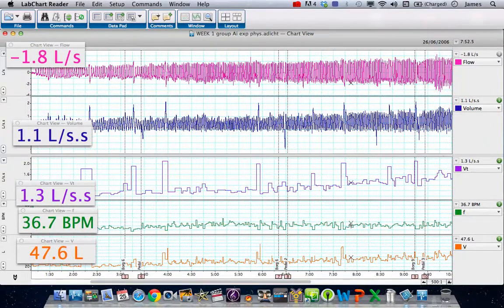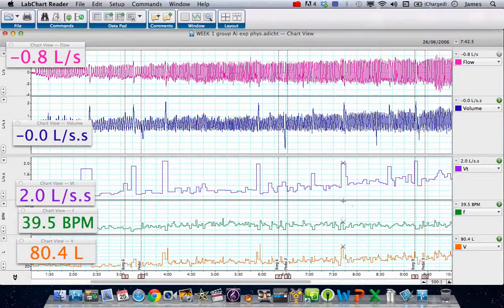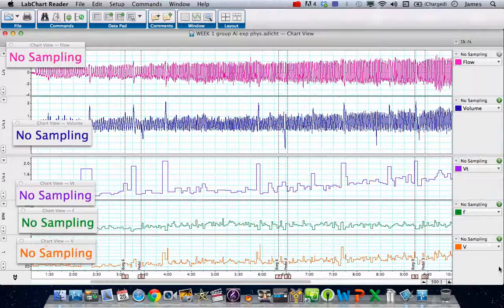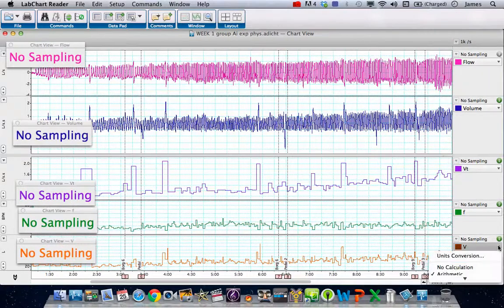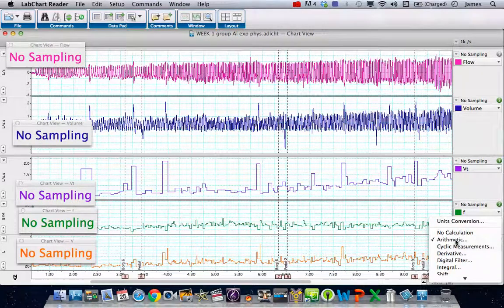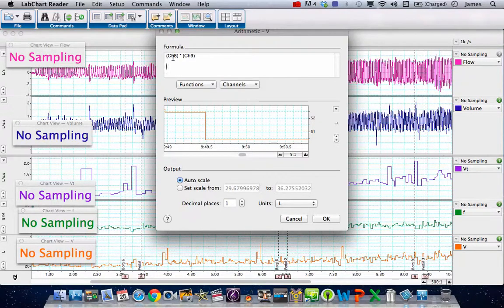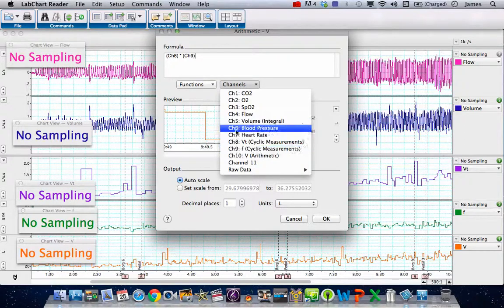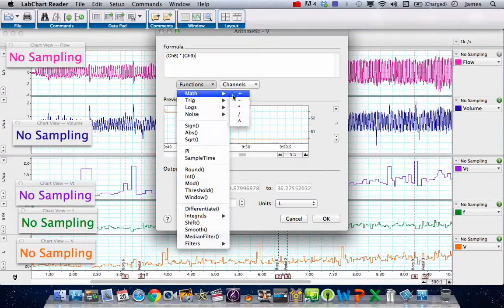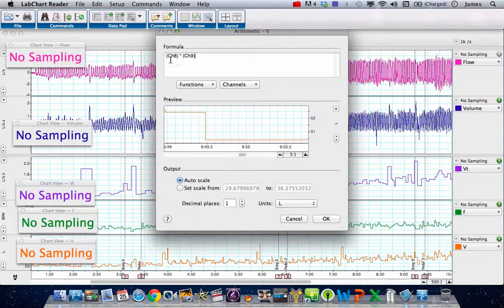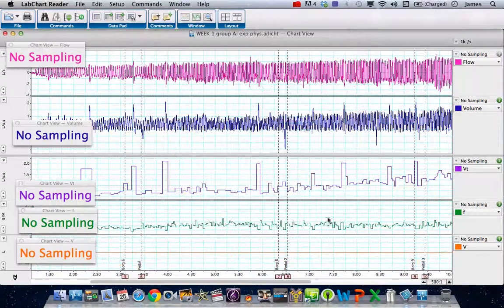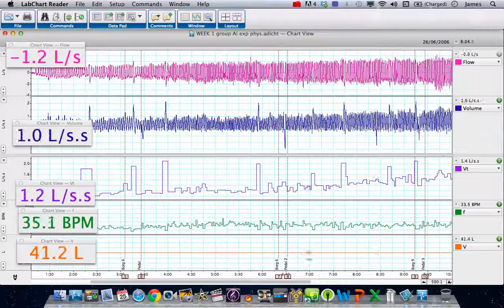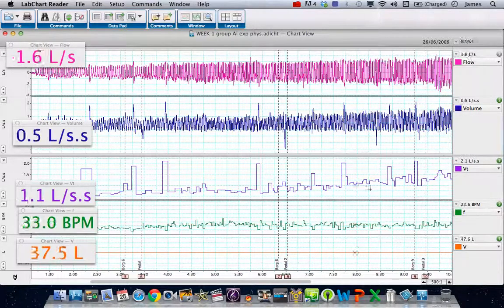So what is minute volume? Well minute volume is VT times F. So we can go to the new channel we created down here, choose arithmetic from the list of options and we times channel 8, which is VT, multiplied by channel 9, which is F. And we do that by adding the channels from the drop down list and then adding an arithmetic function of multiplication from the functions list. We've got channel 8 multiplied by channel 9, press OK and it produces these data here, which you can see if I auto scale it.